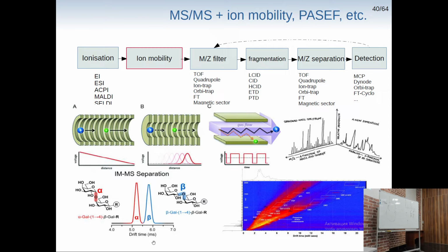Also, another way to get more of your proteome is that we've already discussed that if we have really high separation of our compounds, we can analyze them one by one without any problems, right? We can either get really high resolution and be able to see the difference between our compounds, or we can just try to get them apart to be able to see them.